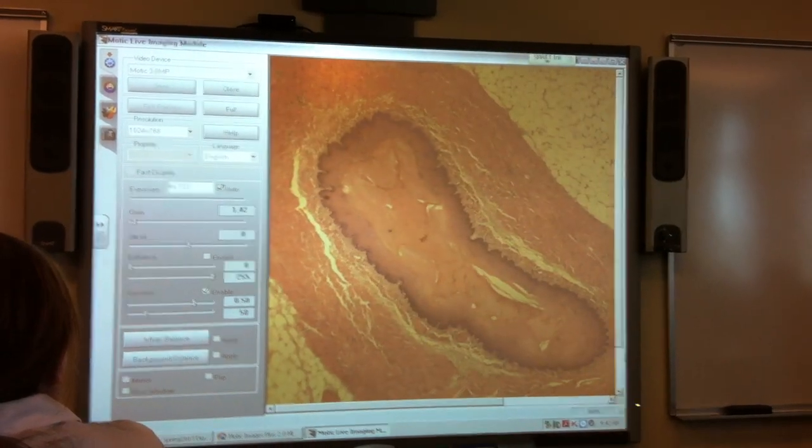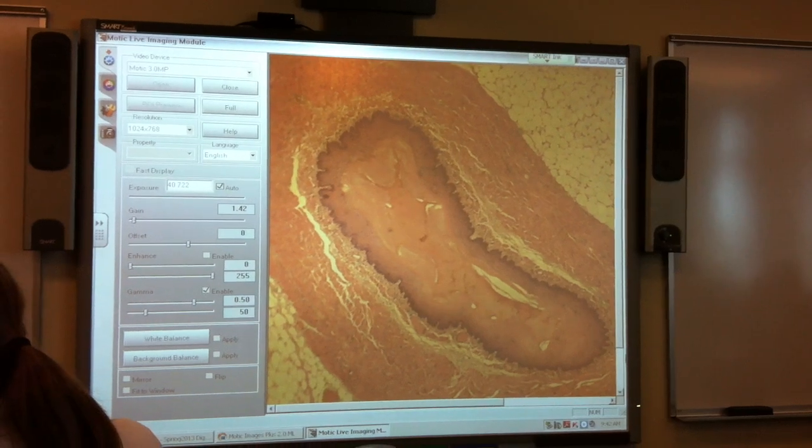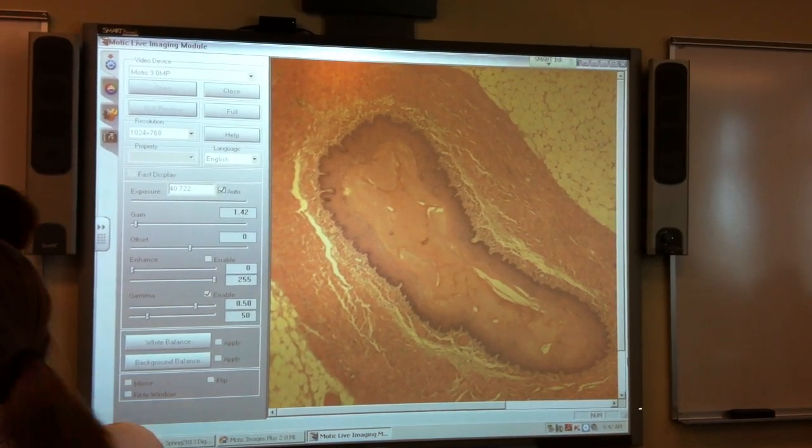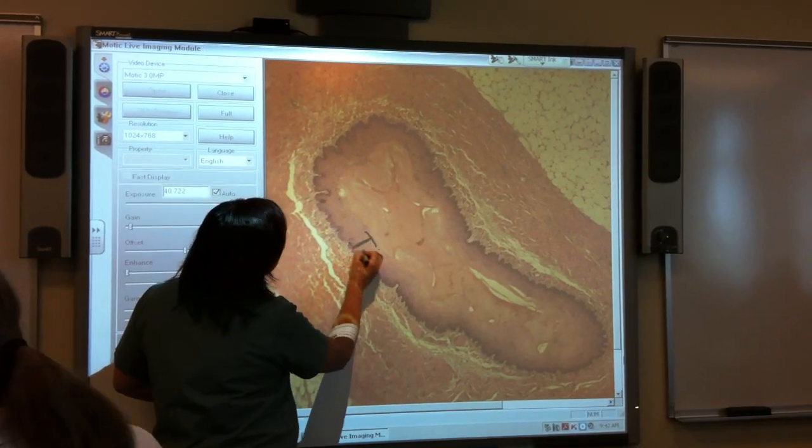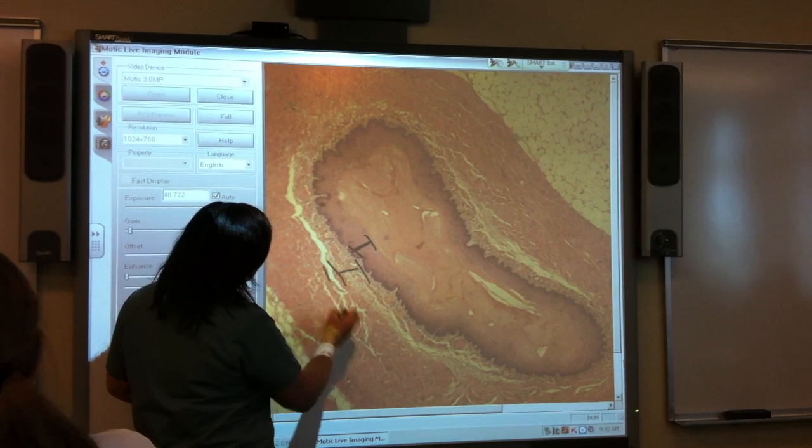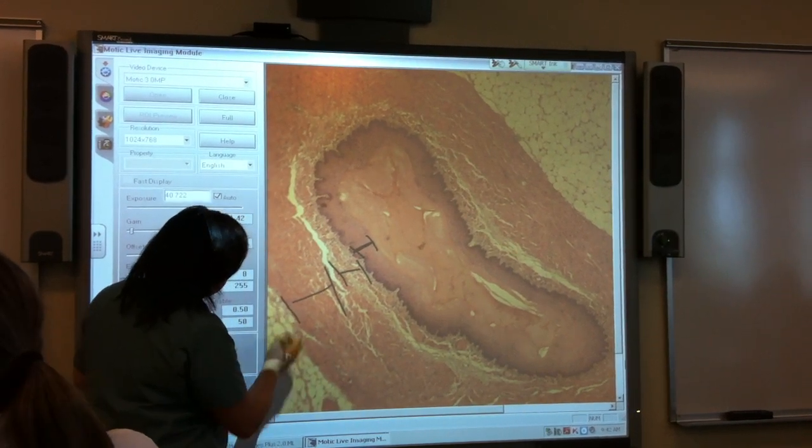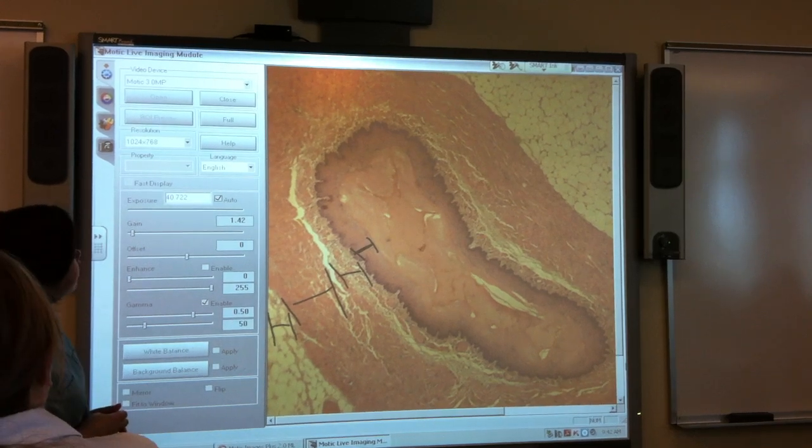And we have the esophagus. Layers. Smooth muscle, stratified squamous, and lumen. Yep. We've got our stratified squamous layer here. Submucosa here. Muscularis externa here. And then the serosa on the outside.